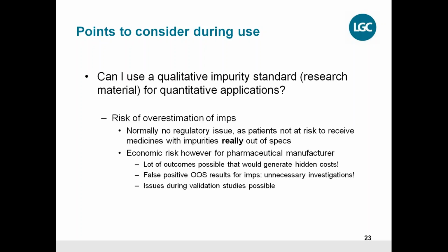There's also the possibility that you have issues during the validation studies, that you come up with false recoveries, or not enough recovery or too much recovery, for example, and then you need to investigate that as well. That is also something delaying the validation study and later the time to market for your generic product, for example, or for your product overall.